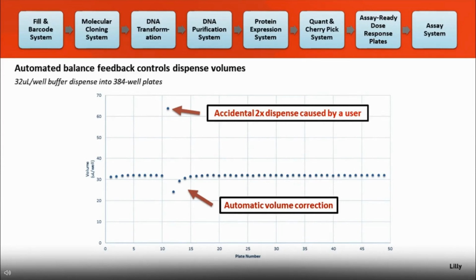And so the next plate, obviously it thinks it overshot this dispense. And so the system undershoots the next plate, it overcompensates a bit. And then within a few plates, it dials itself back onto set point. And that kind of shows the power of this. I think he was pretty impressed to see that, and using this to show other folks how we're controlling things is a nice example of it. Obviously, this is a gross example, and we typically would not have this much of a discrepancy in control.